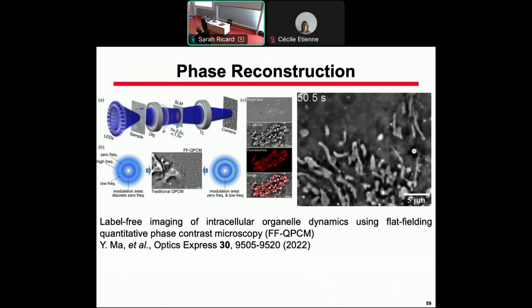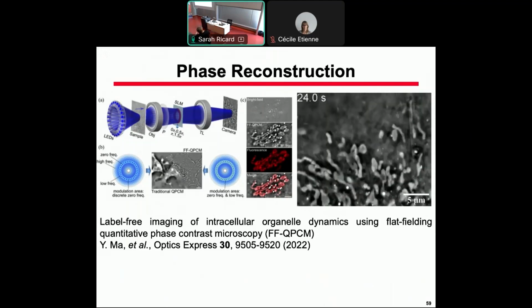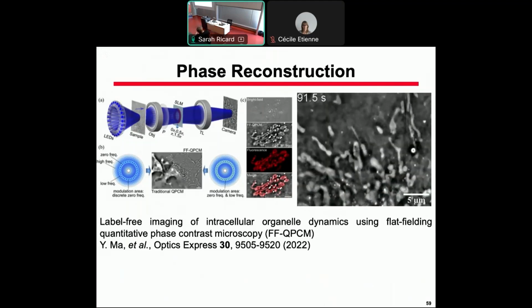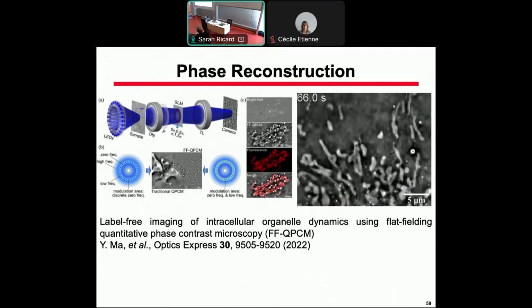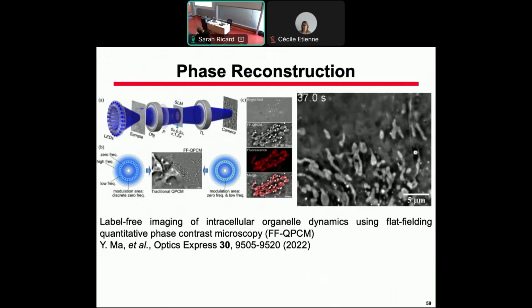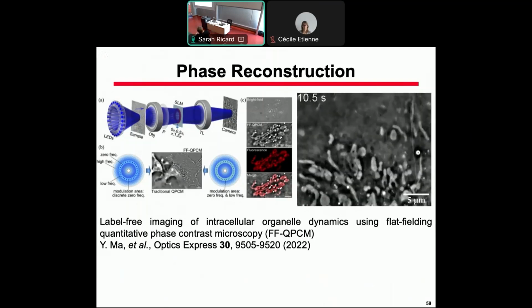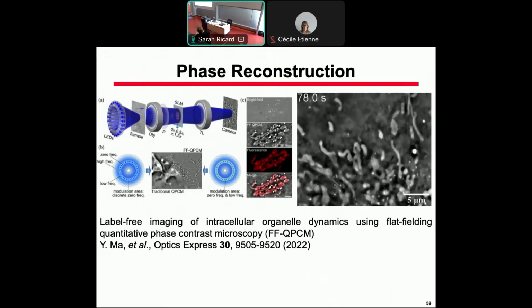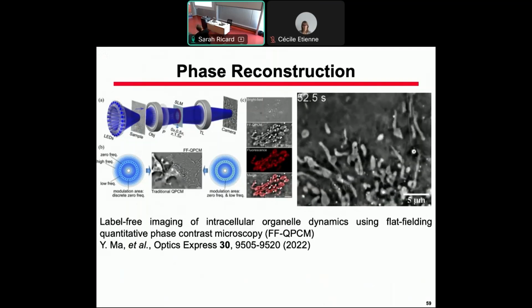You see the bright field image corresponding to this quantitative phase imaging, and fluorescence is superimposed. This is interesting because it simplifies the setup. So just LEDs, no lasers, no fast mirror for scanning. Unfortunately, it works now only on very small, very flat samples. But many groups are working to improve these approaches and try to work on larger samples.